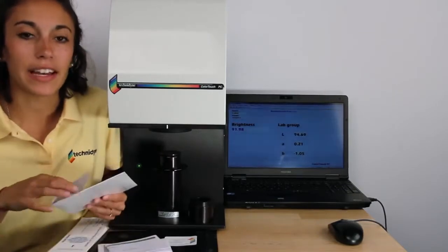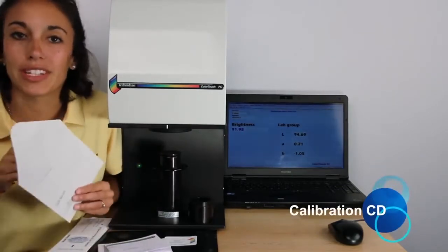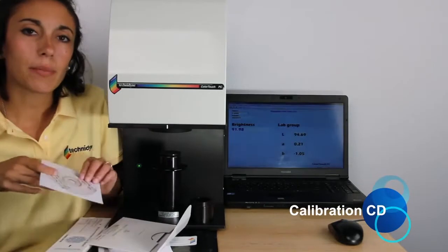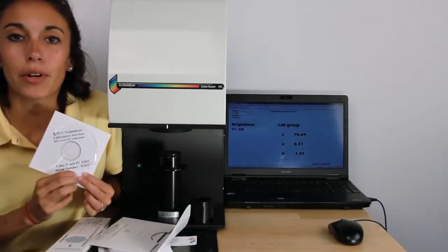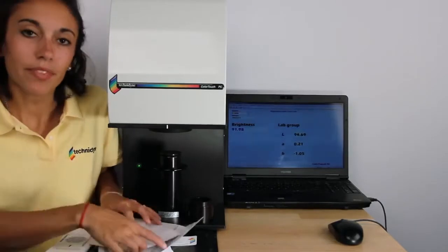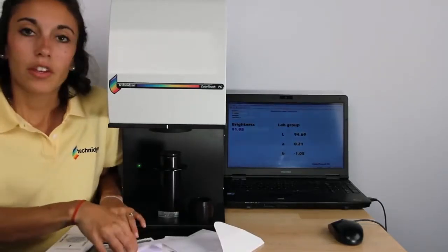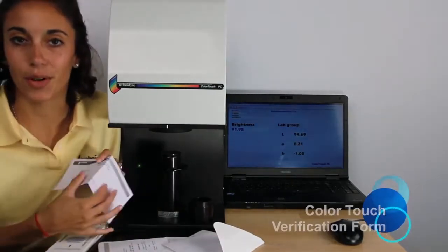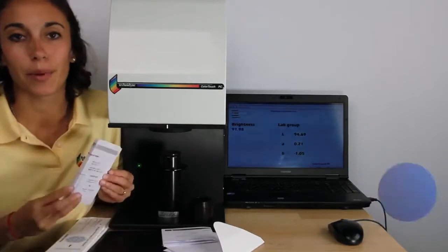The next thing that you'll find is your calibration CD, which is inside your white envelope. It's important to verify that the serial number on the CD matches the serial number that's on the standards. And finally, you'll find your Color Touch verification form and your calibration data sheet.